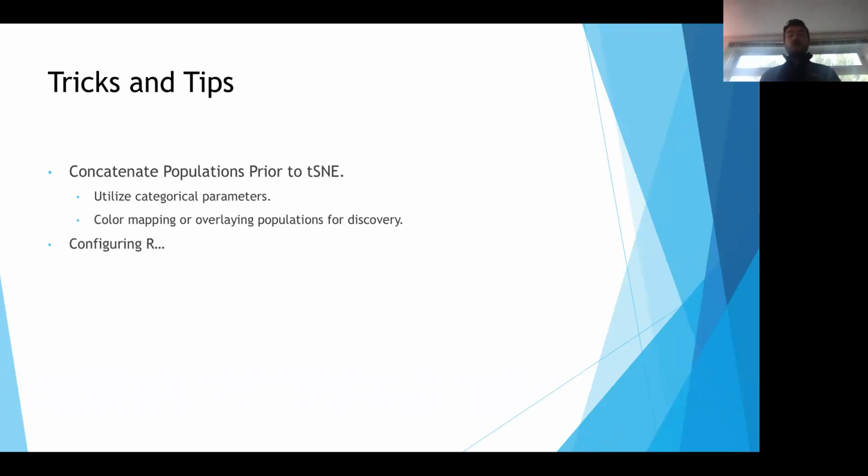And you want to be sure to configure R correctly. Now, this can mean downloading an older version of R or updating your version of R. This can include installing R packages on which certain plugins will depend. For example, there's a whole Seurat package, and it's rather large. If you're going to be running Seurat, you definitely need to have that installed in R. So those are all considerations.